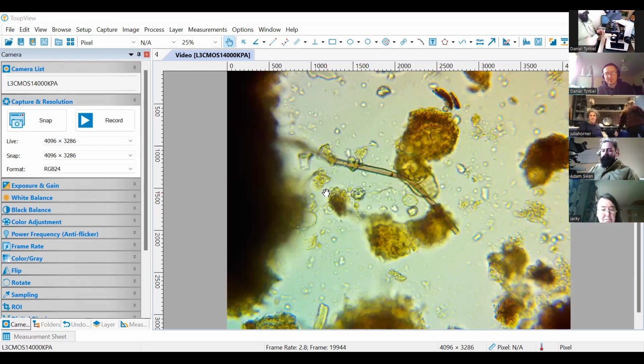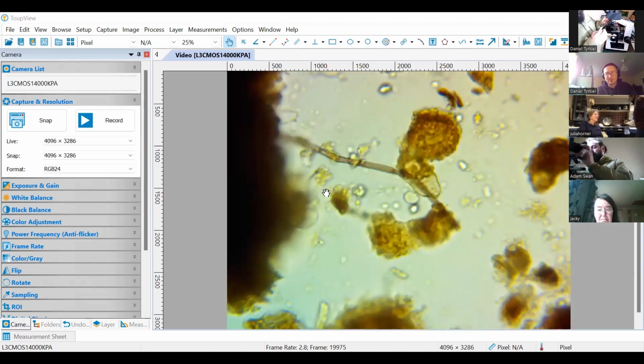And to get you used to doing this, we have this cool calibration slide. Switch over to that for a second.